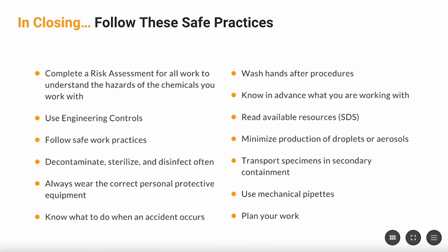Knowing what to do in case of an emergency or accident. Proper hand hygiene and good lab practices. Familiarizing yourself with the materials you are working with and the available resources such as Safety Data Sheet, SDS. Minimizing droplets and aerosols production. Proper handling and transport of specimens and compliance with regulations. Mechanical pipetting and avoiding mouth pipetting. Planning your work in advance and being organized.